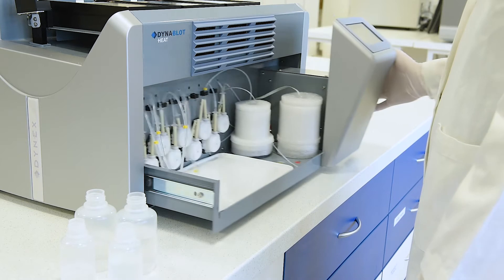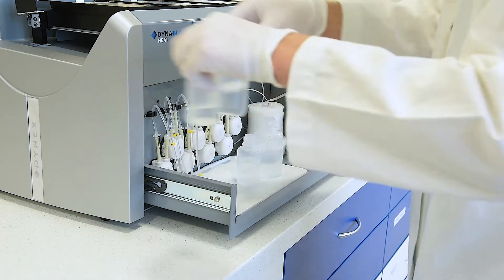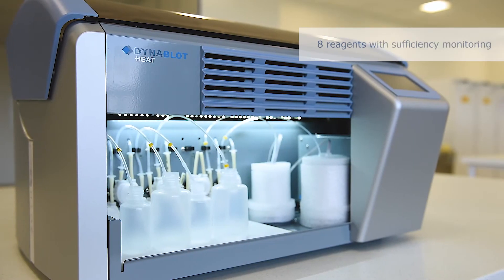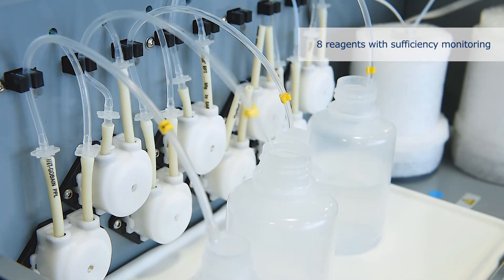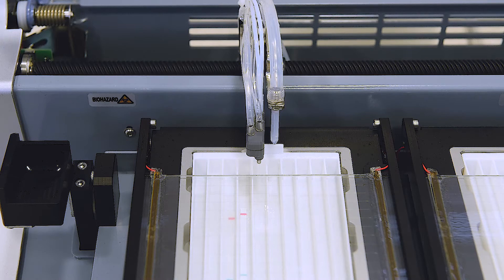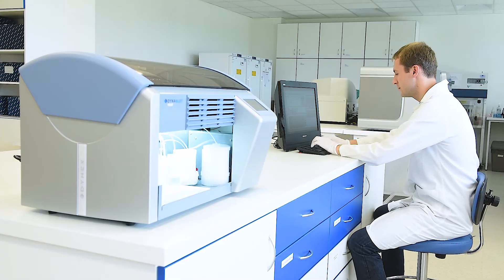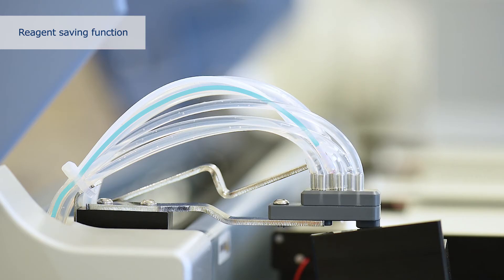The reagent bottles are placed in an easily accessible drawer in the front of the instrument. Up to eight reagents can be dispensed into the tray by a dispensing arm using peristaltic pumps. The channels are equipped with sensors monitoring the fluid sufficiency in the tubing during dispensing. With Dynebolt Heat, it is possible to save the reagents and return them out of the tubes back to the reagent bottles.